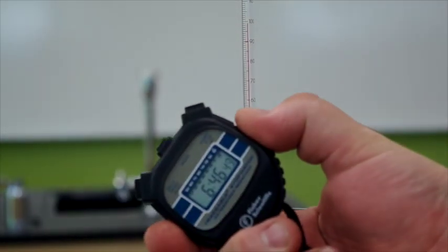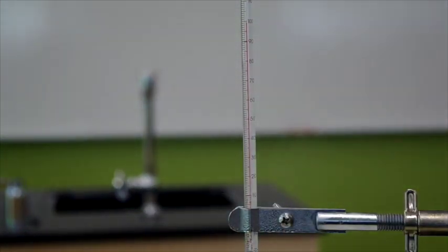At 6:45, it is boiling. Do you see the boiling?